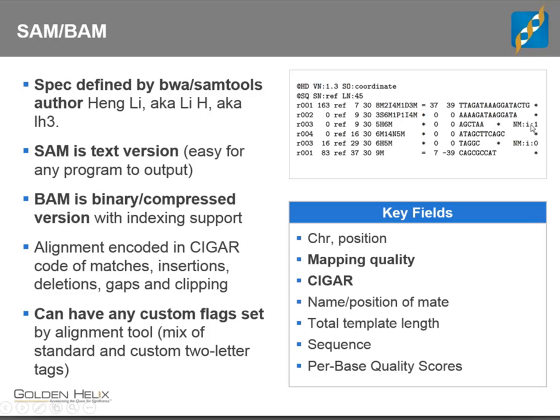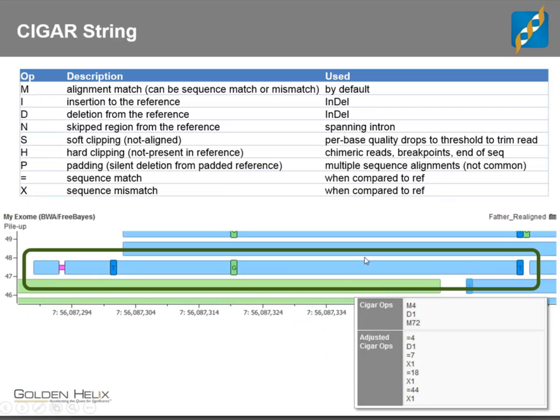So we're going to touch on the CIGAR string next. The other thing to keep in mind is there's a field here which is an arbitrary key-value pair. It's not required, but you can put in pieces of information that might be useful for the user or for the variant calling algorithm. There's a code, which is a two-letter code followed by the type of data followed by the data. So NM, I, and then 1. There are standard codes for specific things, and we'll touch on a couple of those, such as the number of mismatches that the read has to the human genome. Some of those codes are very useful, and you might use them for filtering.